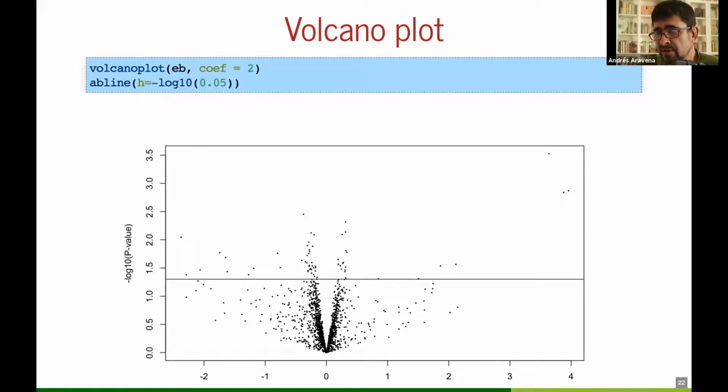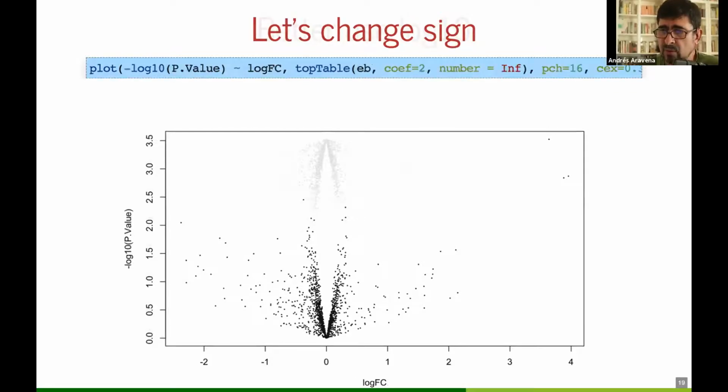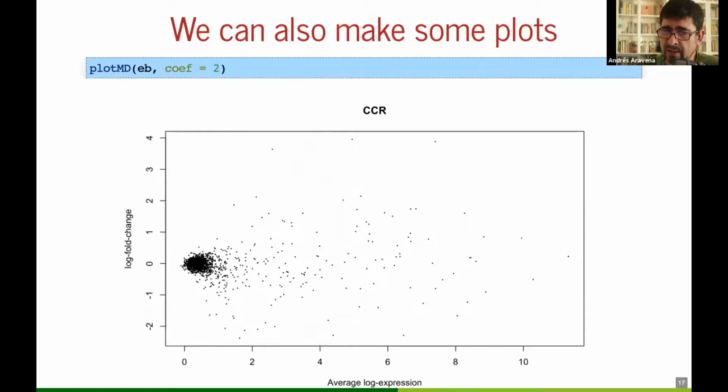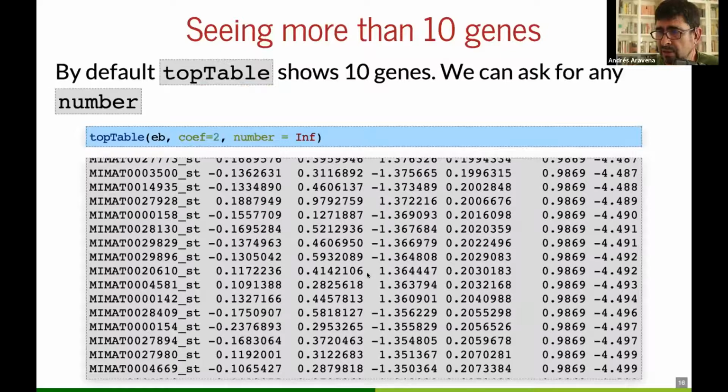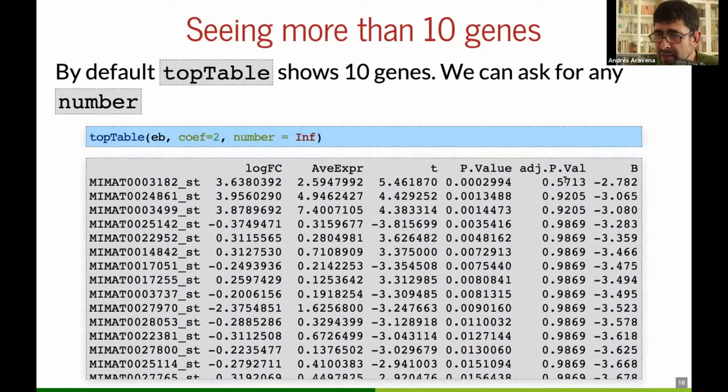And I think one of the reasons is because if you notice, the numbers that we got for this case were very bad. Let me show you. And that was the origin of our problem here. The adjusted p-values here are almost 1 in all cases, you see, 0.98. And the best one is 57%. So in this case, the adjusted p-value essentially says, look, you have nothing.